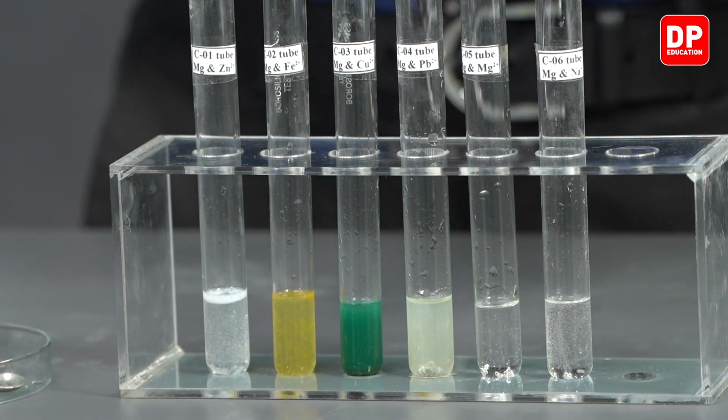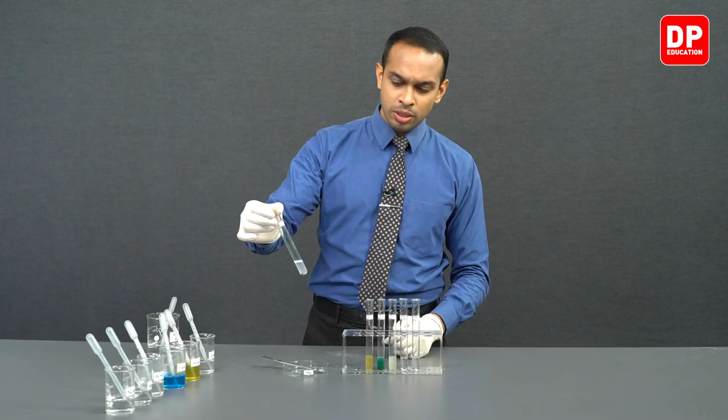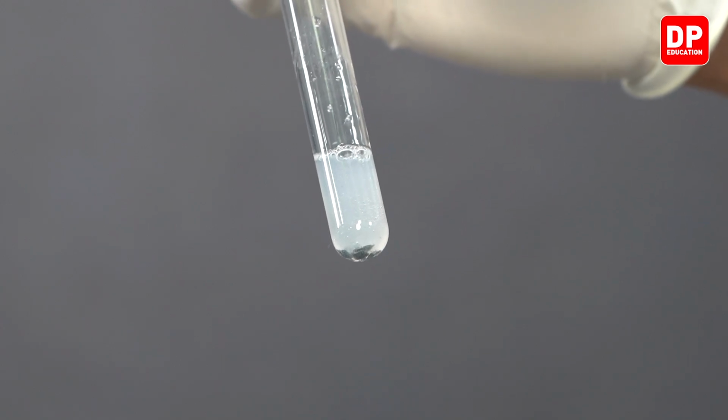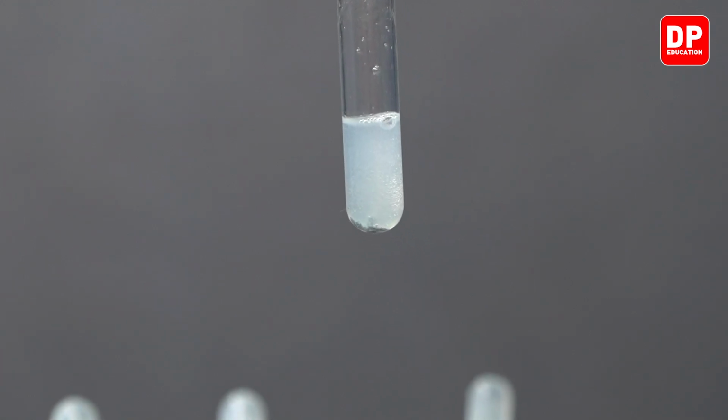Out of the solutions that are over here, you can observe the zinc solution shows a clear reaction here. You can see when you shake it, a whitish precipitate is observed. So zinc 2 plus ions have been displaced as zinc solid.